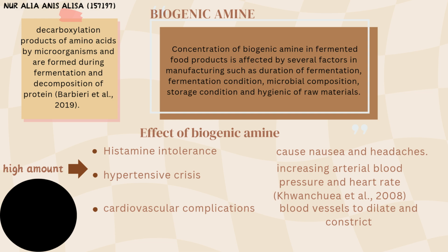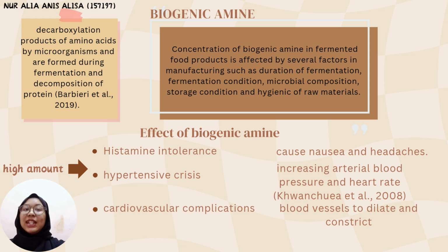My name is Nur Ali Anis Alisa. In my part, it is about biogenic amine and HPLC. In this slide, it is about biogenic amine. Biogenic amine is a decarboxylation product of amino acids by microorganisms that form during fermentation and decomposition of protein. Biogenic amine can be found in fermented foods such as cheese, fermented vegetables, and fruit.